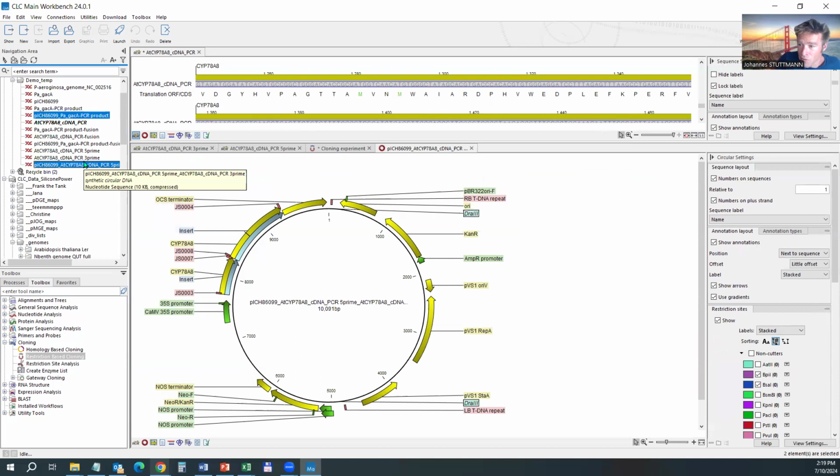Of course, this may not appear very logical to do so, but this is because of the hierarchical DNA assembly, which quite often requires that you eliminate internal sites. So with the system that Silva and I use, it would be BSA1 and BPI1 that are strictly forbidden, and BSMB1 becomes a problem when you want to go into very complex assemblies through different levels. Then it should also be eliminated.